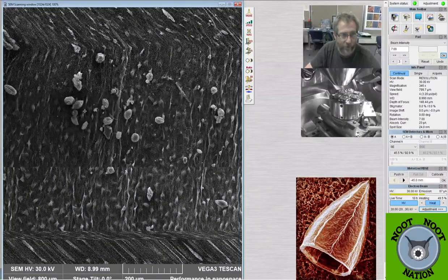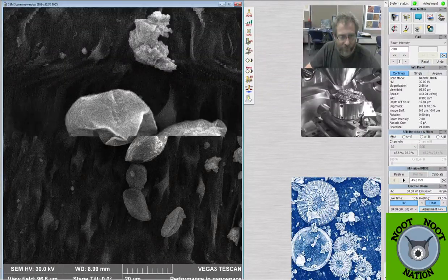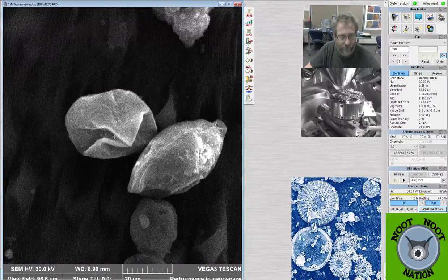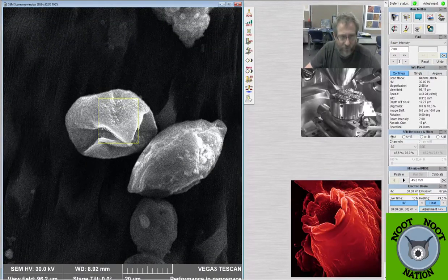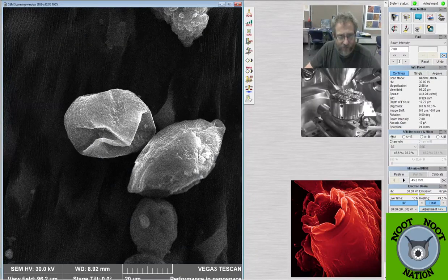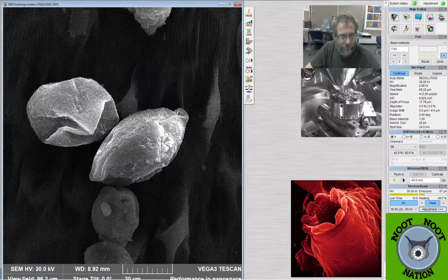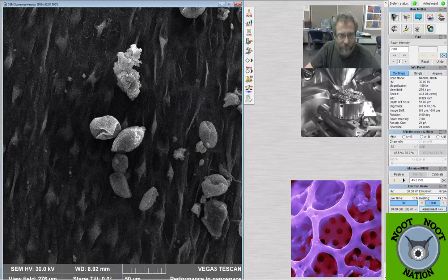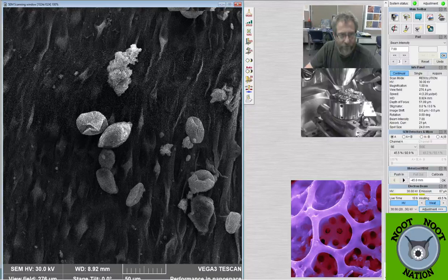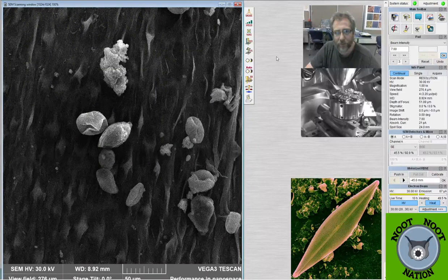These ones look more globe-shaped, right? And here, these ones. I think that's the maple pollen. So I'm going to try to get it into some sort of tight image. Zoom out just a little bit. You can see they kind of look like they have a little beak. Here's one with the little beak-looking thing. It's a little dark.